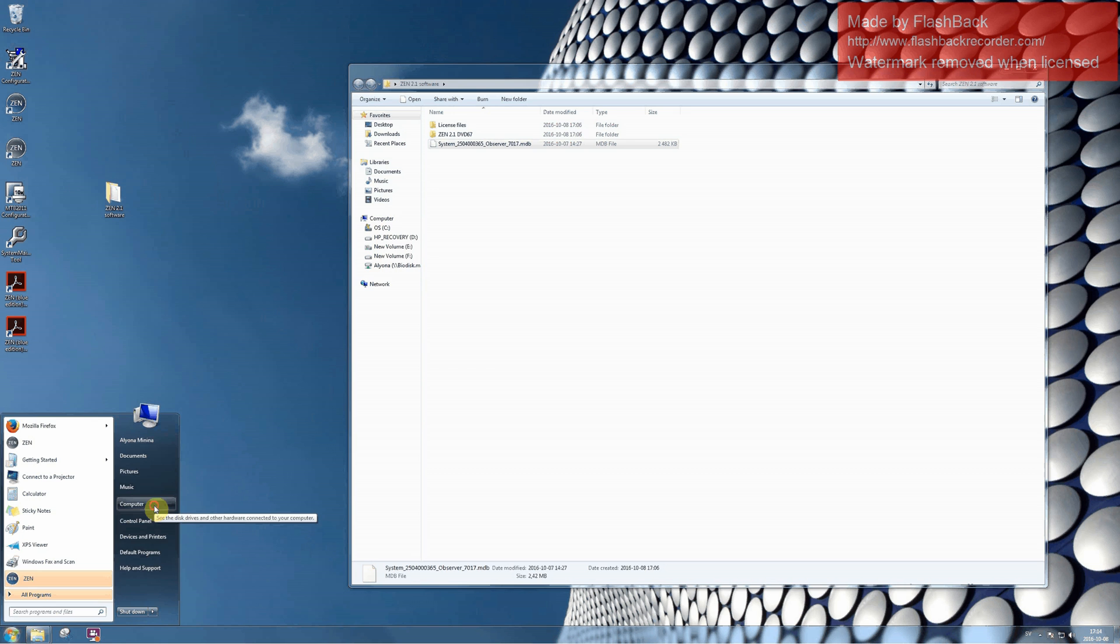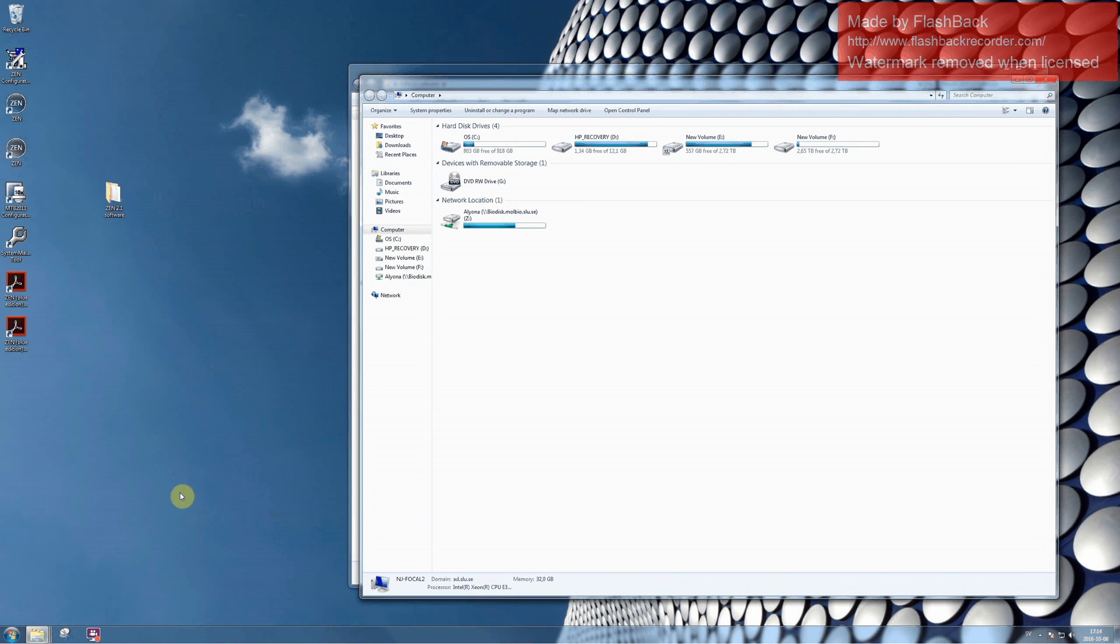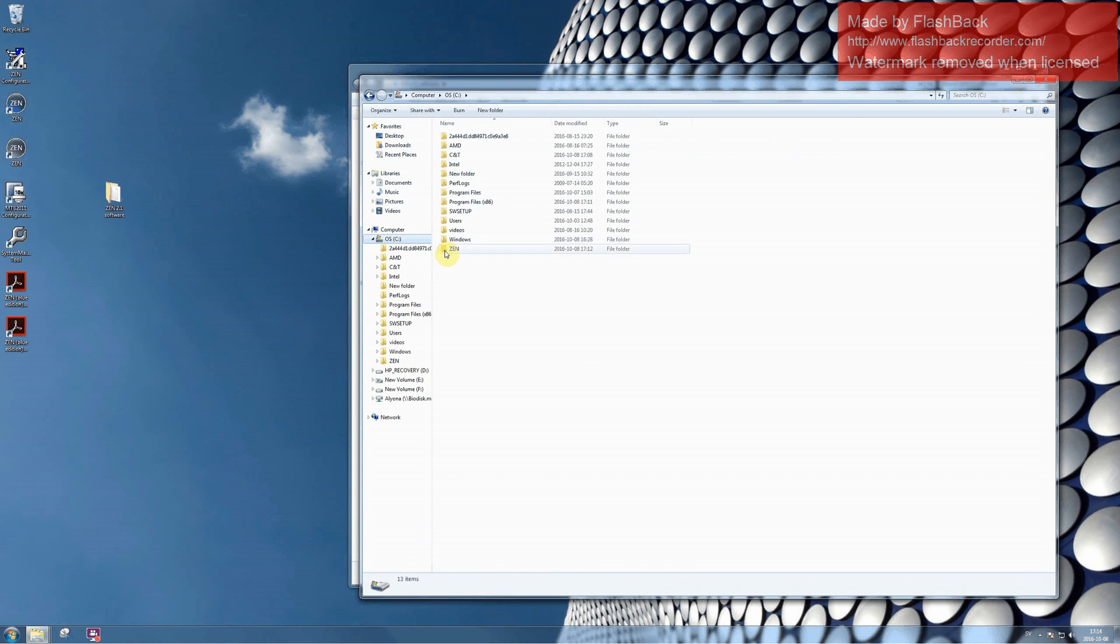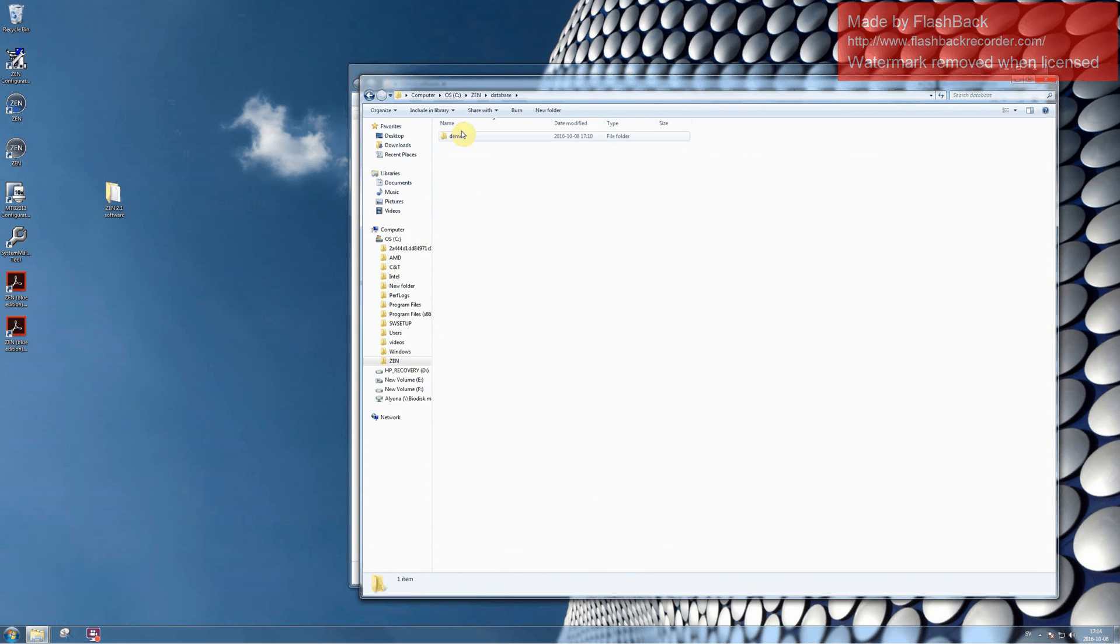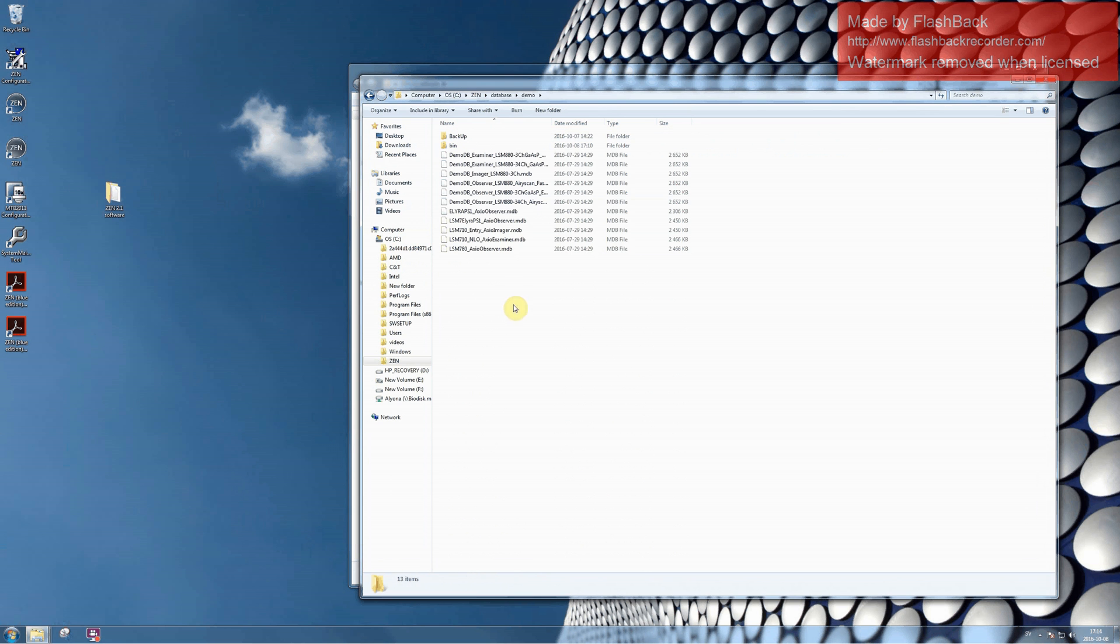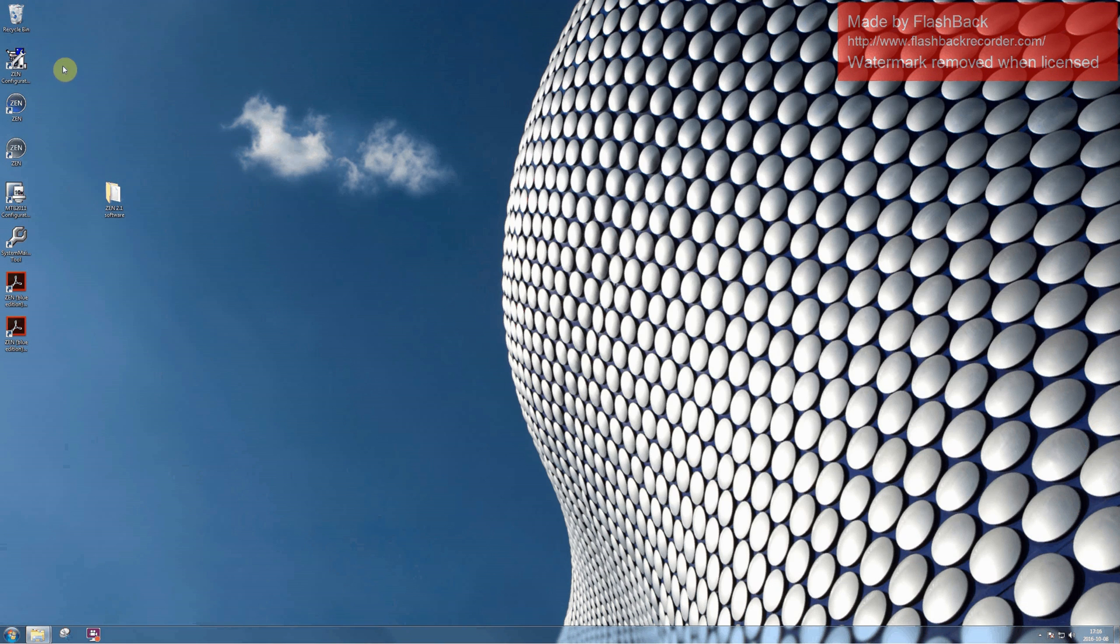Go to Computer, Disk C, Zen, Databases, Demo, and paste the configuration here. Then proceed to Zen Configuration tool.